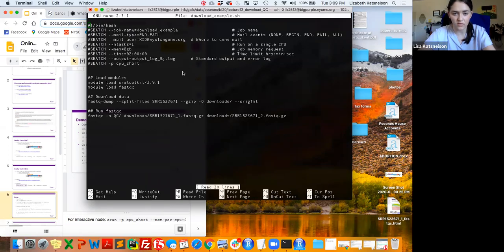Okay, I'm seeing that someone can't access the data. Interesting. Okay, hopefully you can get into this folder. It should be available to everyone. Make sure that you have your VPN running so you can SSH into BigPurple. And if you're trying to get into the class directory, it is only on BigPurple. If you're working with prints, it will not be in there. We're trying to get a folder available for us on prints, but I don't think we have that yet.